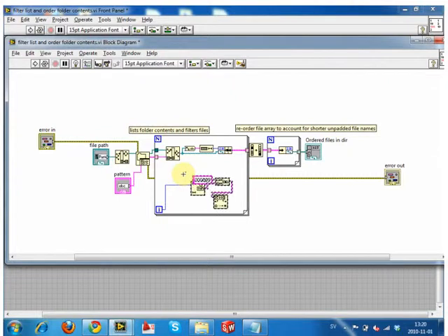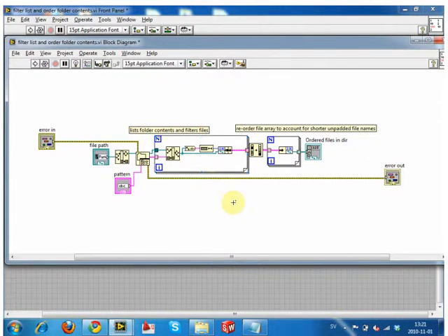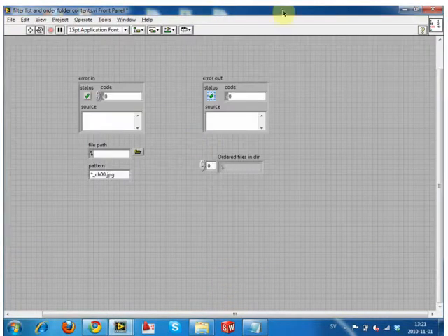And if you have questions on that, I can show you exactly how you would do it for that example whenever it pops up. But just bear in mind that numbering schemes are problematic with lots of programs. And what I'm going to show you here is if you ran the previous one on a certain data set, you'll see a difference, because before this was actually a bug.